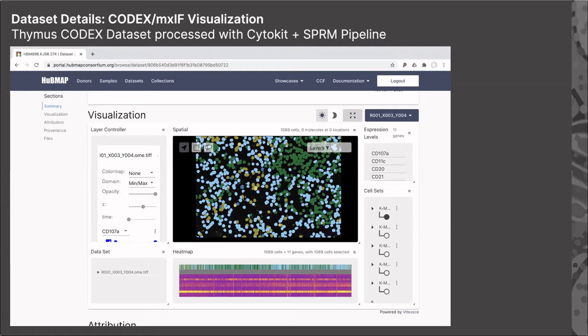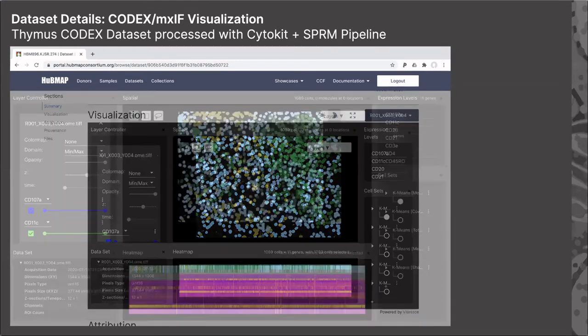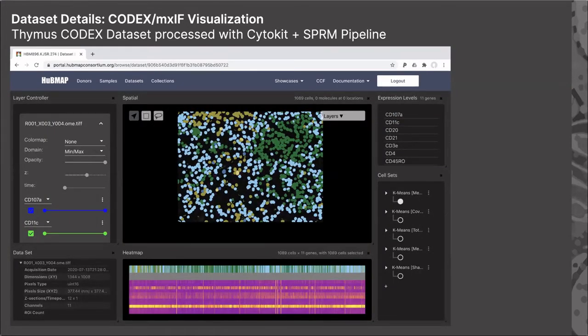So there's a k-means clustering that is selected with a couple of different clusters. This is not a very large number here. You can tell by the number of colors. I think there are about 4 or 5 clusters. And let's take a closer look. So the first thing we can do, because it's imaging data, it's nicer on the eye to just change the color scheme here. Let's make the whole thing bigger. It's all managed through the UI. And then we can take a look at these results here.